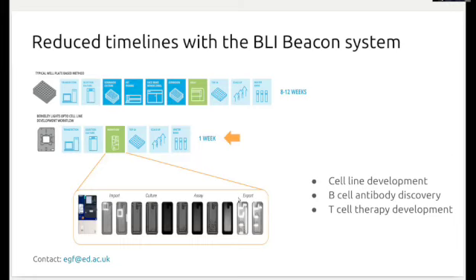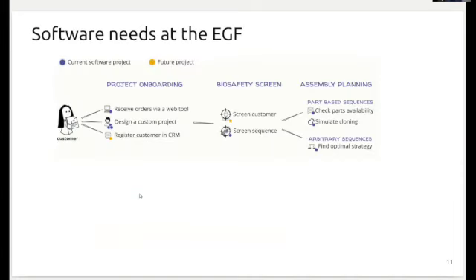As you can see at the bottom how it works, the light cages capture the cells and move them in or out of the individual pens, or wells, and then you can culture them, assay them, treat them, co-culture the cells and so on, and then individually separate and collect the cells into 96 well plates where you can further treat them, proliferate them, or get genome readouts by sequencing.